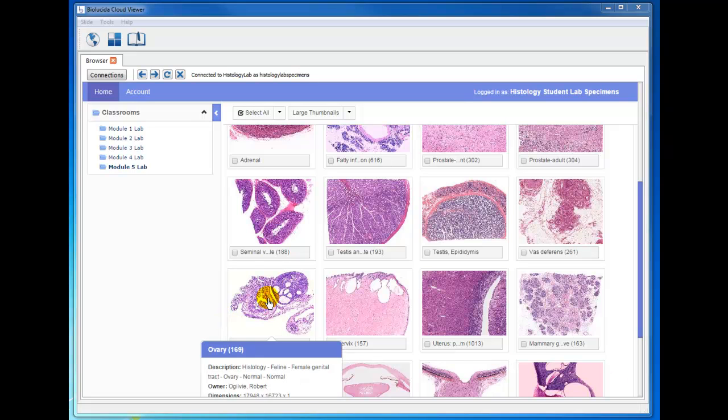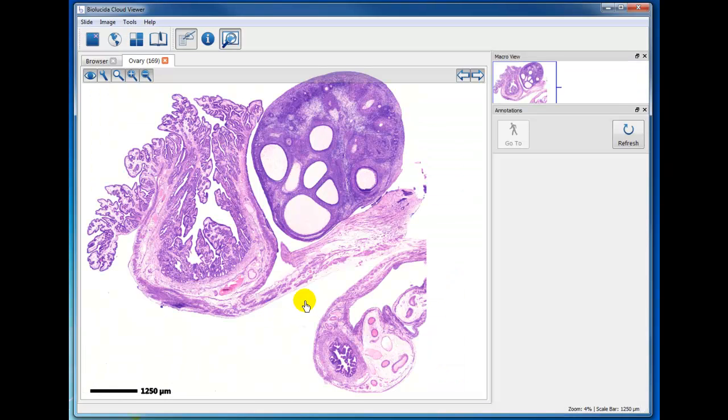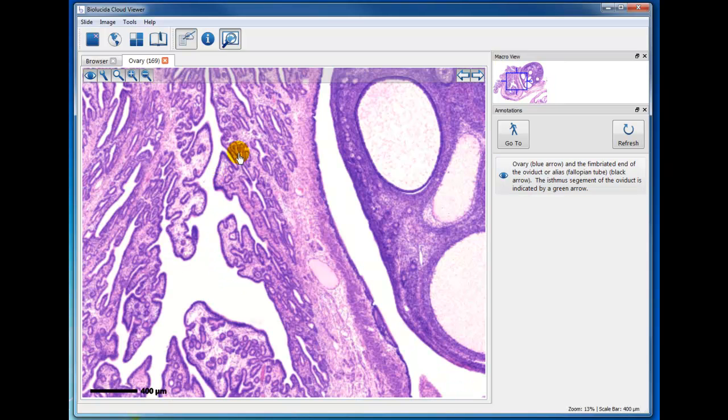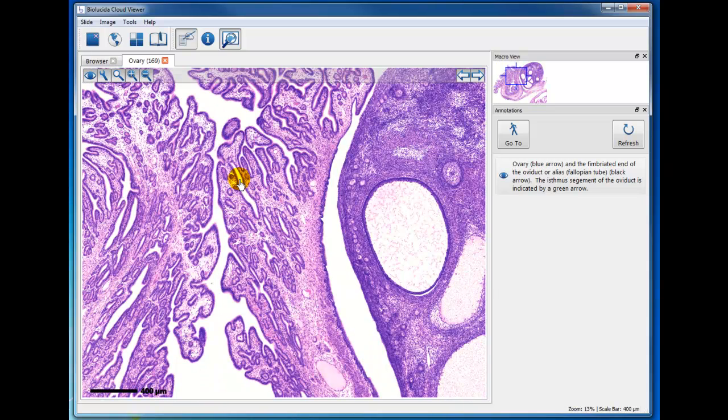This video will give you a brief tour of the fallopian tube, or also referred to correctly as the oviduct. And here in this specimen we have annotated it to show you that this is the ovary here, and the oviduct is very close to the ovary, and the fimbriated end, which this is, the end of the oviduct, has these long finger-like projections of the mucosa that really pretty much envelop and close by the ovary to catch an egg when it's ovulated.